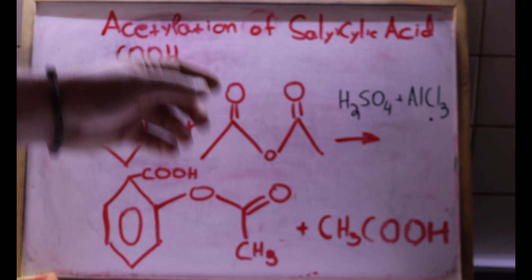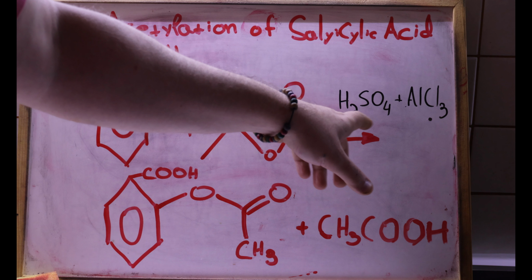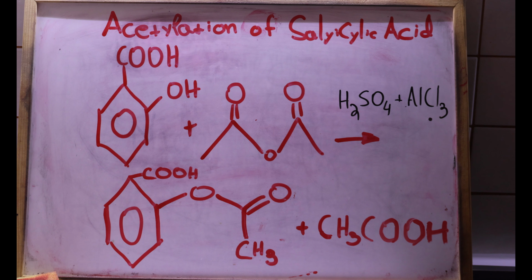The common catalyst used is just concentrated sulfuric acid, but my sulfuric acid has some moisture in it, it's not completely dry, like 98%, which would be required.